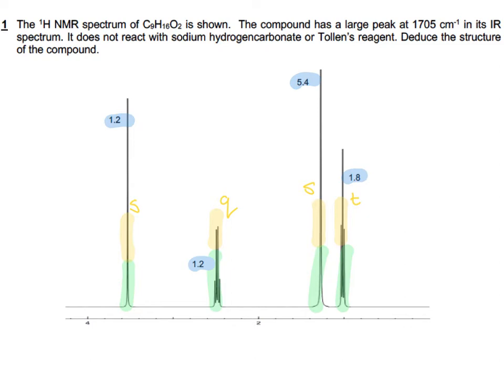And then the very final piece of information is, if you look along the bottom, there's a scale, and this is called the chemical shift. If you look at your AQA data booklet that you get for the final exam, on page 3, which has the infrared spectroscopy absorption values, it also has the proton NMR or hydrogen NMR chemical shift values and the carbon-13 NMR chemical shift values.